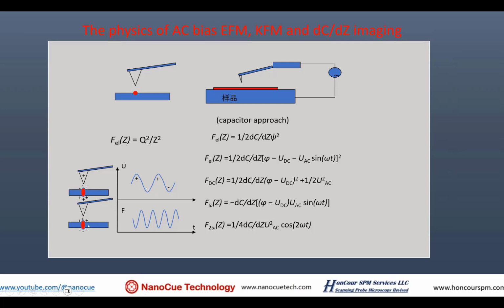The polarization of the sample will flip, and on either the positive peak or the negative peak, the force between tip and sample will become maximum. In other words, the maximum force is reached twice in one period of this oscillation. So the tip is oscillated, or senses the force, at double the frequency, and this double frequency is a measurement of the polarization of the sample.